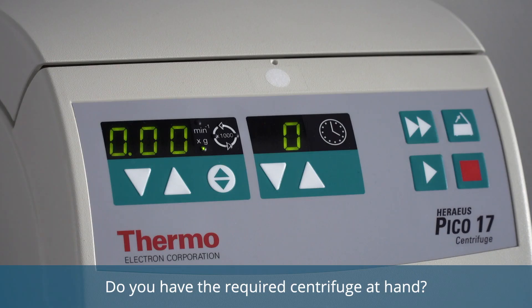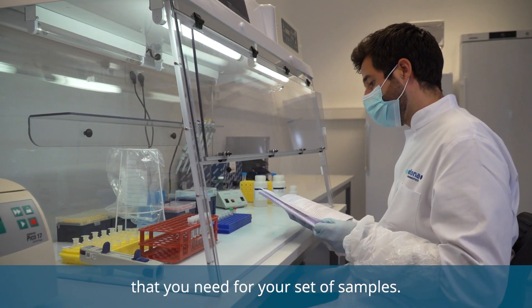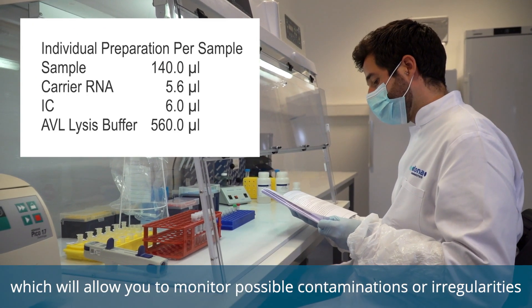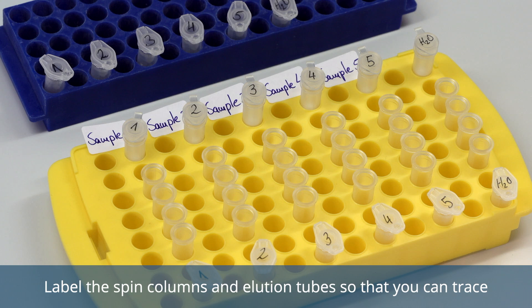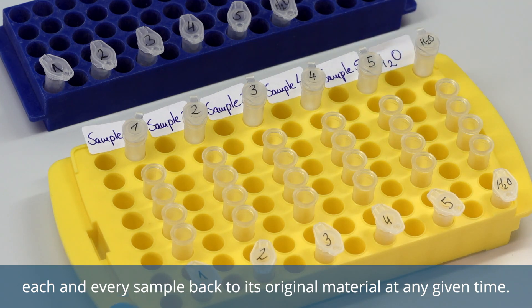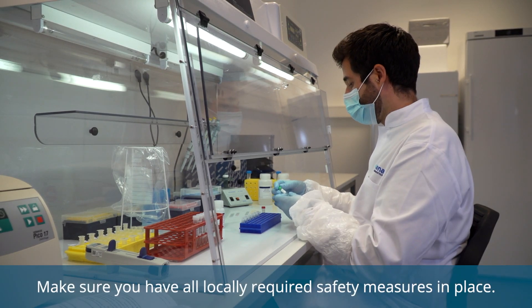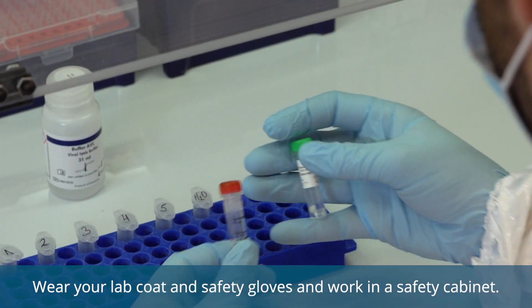Do you have the required centrifuge at hand? Now calculate the reagents and materials that you need for your set of samples. Please make sure to include one water sample, the extraction negative control, which will allow you to monitor possible contaminations or irregularities when you analyze your PCR run. Label the spin columns and elution tubes so that you can trace each and every sample back to its original material at any given time. Now you are good to go. Start with the lysis and inactivation of the potential infectious sample material. Make sure you have all locally required safety measures in place.